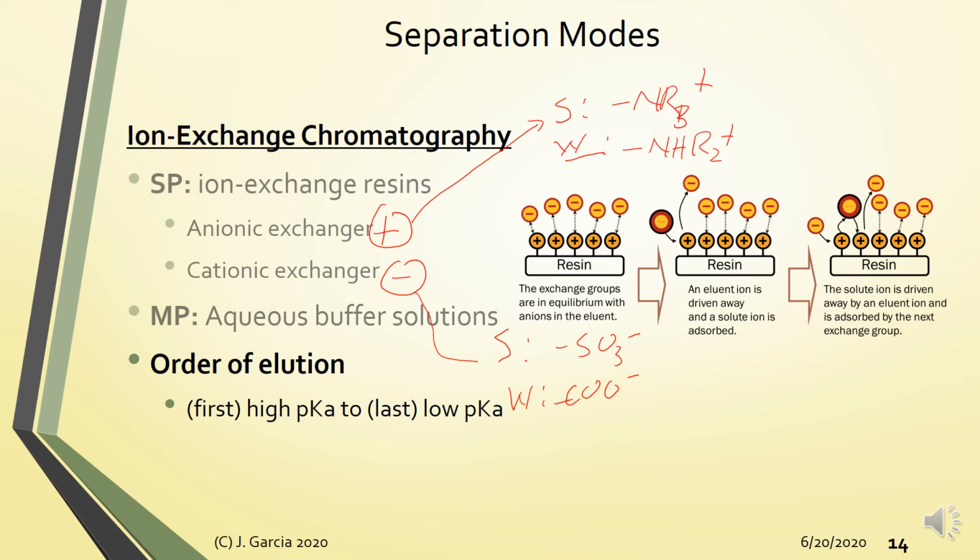So this is considering an alkaline mobile phase. Okay? Or in terms of valency, monovalent compounds or monovalent ions. Kasi ang ion exchange chromatography can also be used for inorganic ions. Mga chlorides, sulfates, nitrates, or sodium, aluminum, barium ions. So pwedeng gamitin ng ion exchange chromatography doon. So monovalent compounds will be eluted first, whereas polyvalent compounds or ions will be eluted last. Because the greater your charge, the more attracted you are to the stationary phase.